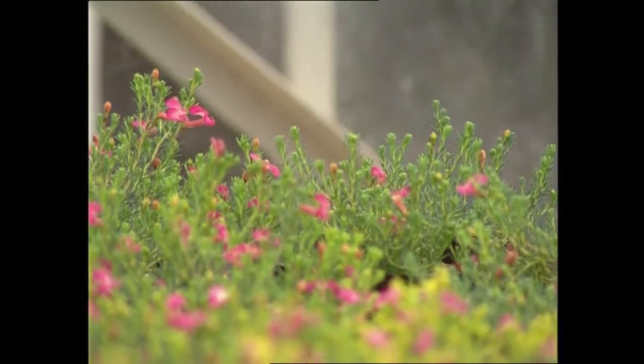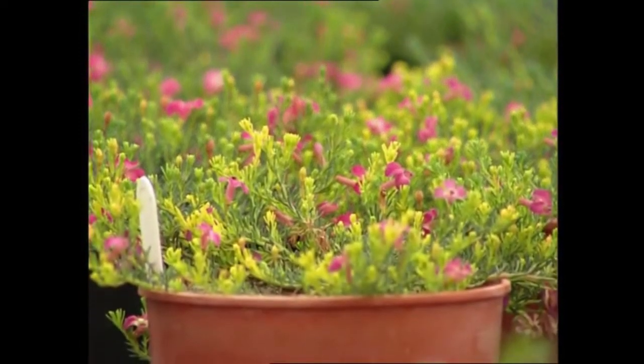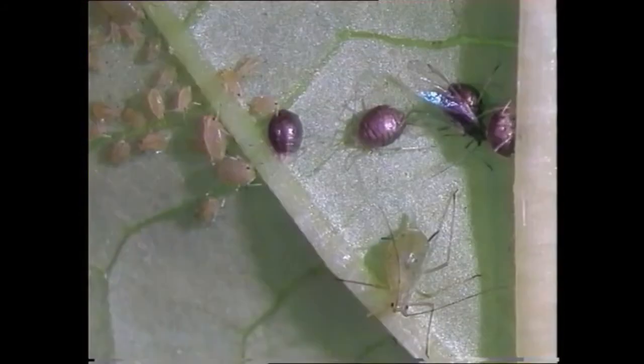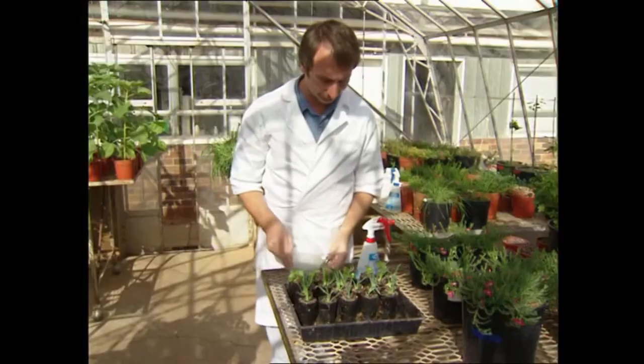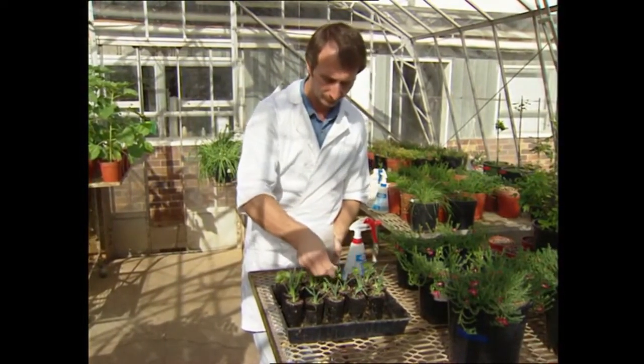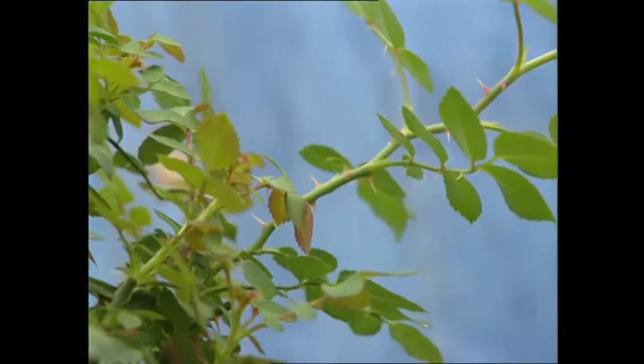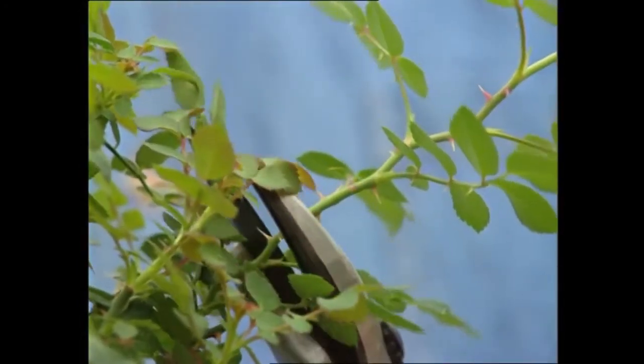So, at the preparatory stage, we need to ensure that the stock plant is growing vigorously and is free from pests and diseases, especially the microscopic pests such as mites and thrips. By establishing the stock plants in a glasshouse, we can ensure that the plants have been fertilized properly, have been sprayed with pesticides and fungicides, and have been pruned so that new, young, vigorous growing shoots are established.